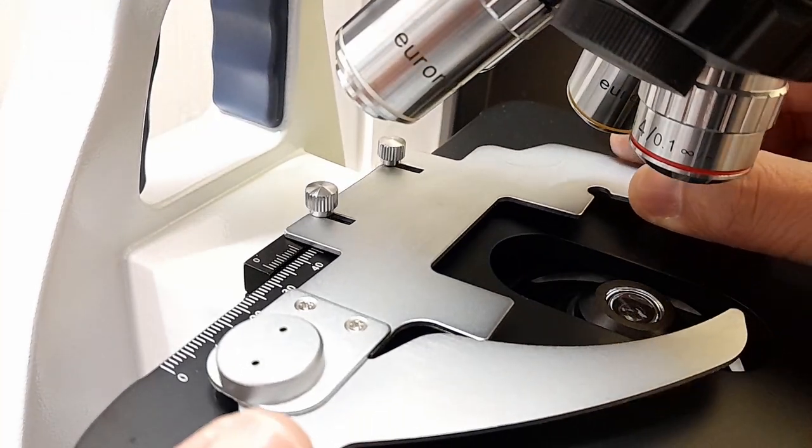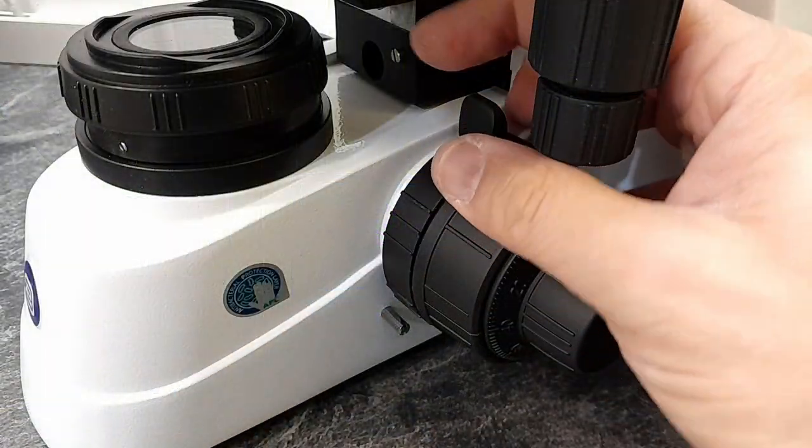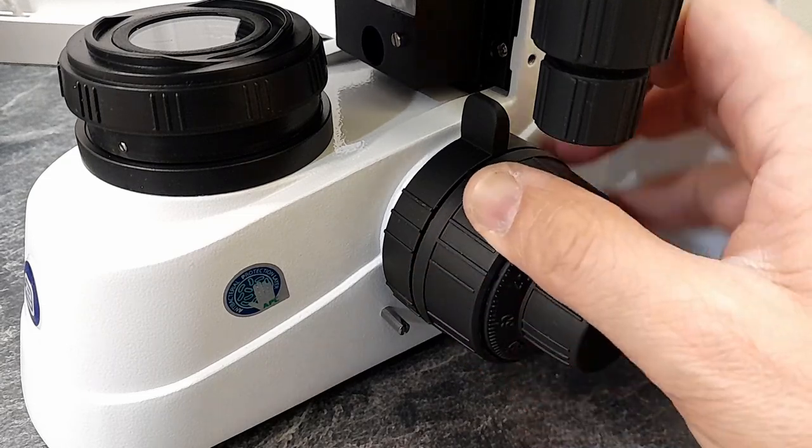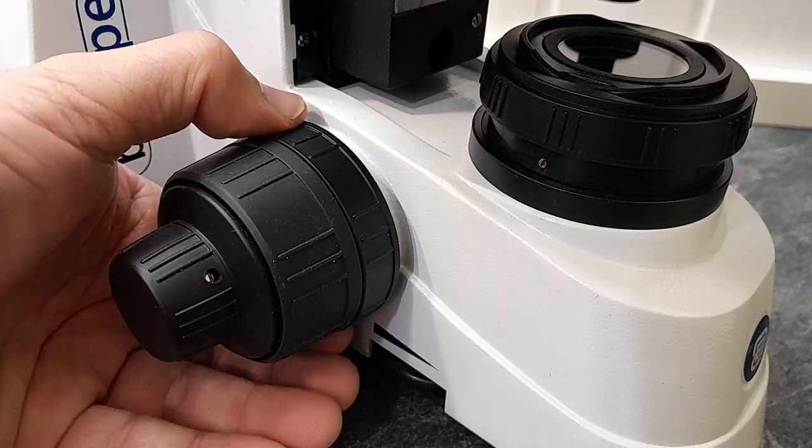On the right side of the microscope there is the focus lock lever, which allows you to lock the stage at the highest position. If you do not want the stage to go higher than a set point, you simply flip the focus lock lever and that will be the highest position. This is important for protecting the objectives from crashing into the slide, and it's also very useful for oil immersion work — you can lower the stage, apply immersion oil to the new slide, and use the coarse focus knob to raise the stage back to the maximum position so everything is in focus again. On the other side there is a focus tension adjustment ring, which allows you to adjust the tension of the coarse focus knob to your own personal preferences.